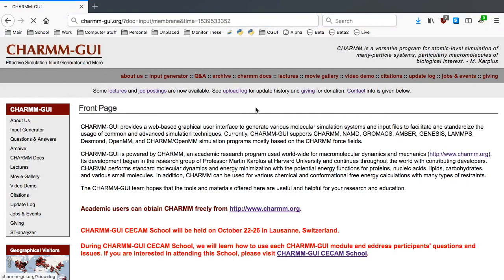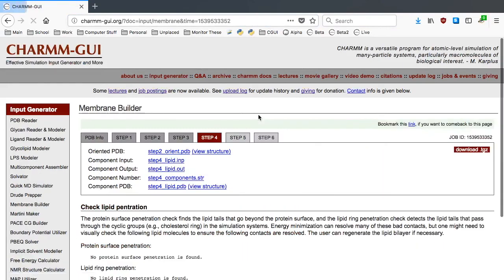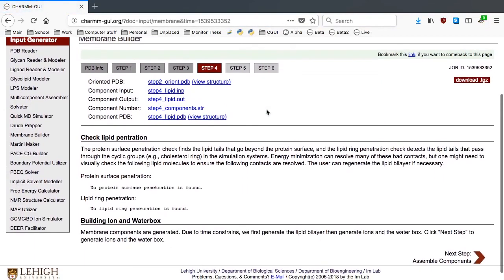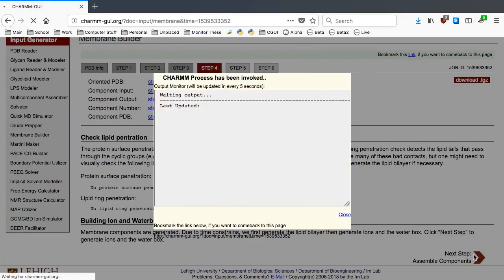When it finishes, click Next Step to build the waterbox and ions. It should take about 2-3 minutes for our system.